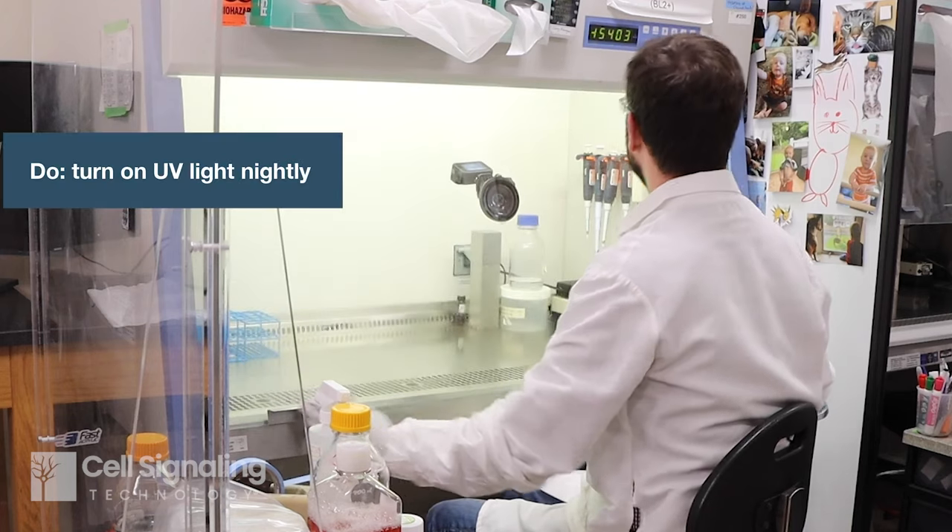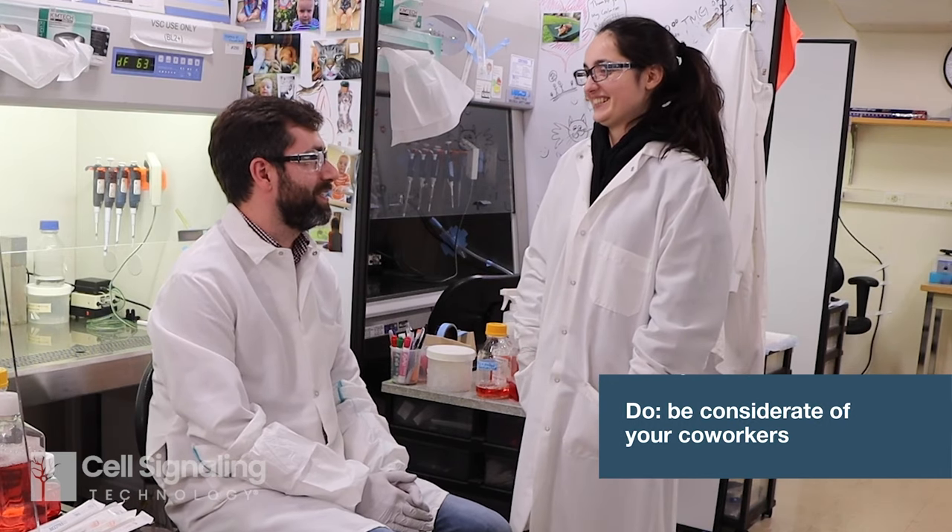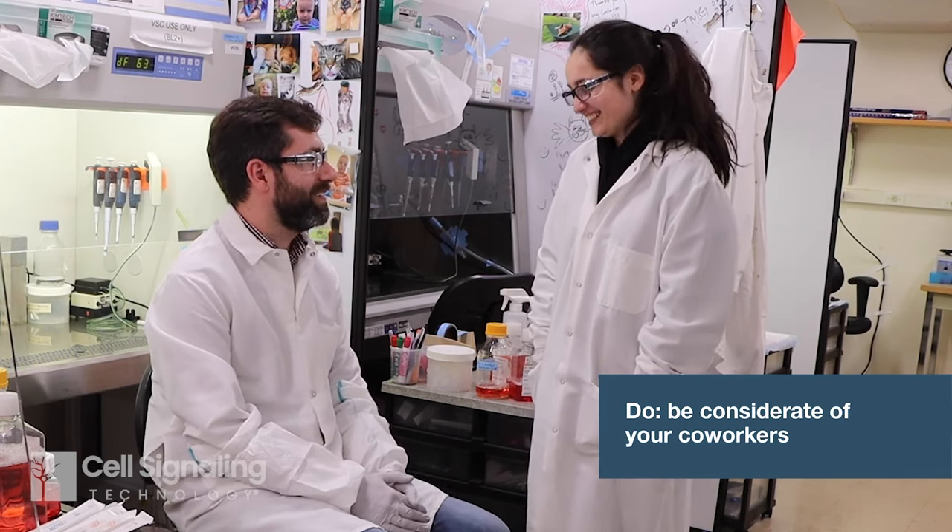The cell culture room is usually a shared resource, so it's always a good idea to be considerate of your coworkers when scheduling time in the biosafety cabinet. Keep tidy and communicate about any issues that may arise so that everyone can keep their experiments running.